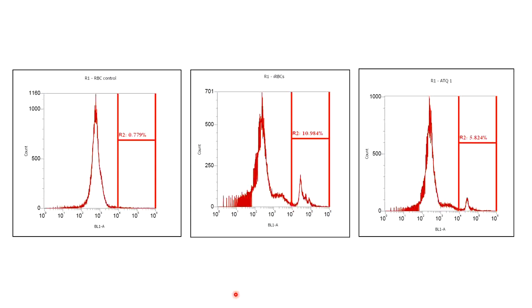So here we are testing a drug against plasmodium, not just by treating the plasmodium in a culture plate, but in its natural environment, which gives us more authentic results. And what was the out of the box thinking in the complete process? That RBCs don't have a nucleus, so they don't give DNA content fluorescence. But if a pathogen is present in the RBC, it will start giving the signal. And once you have the signals, you can measure them, and you can measure the percentage infection or intensity of infection.